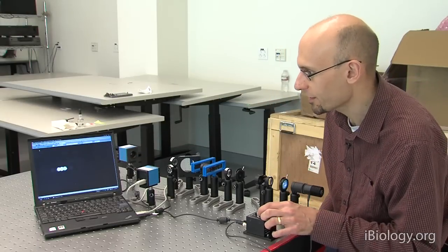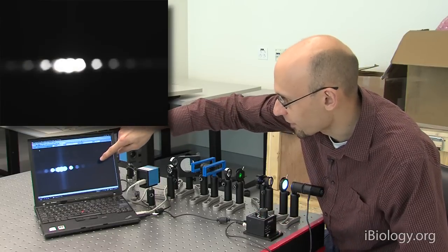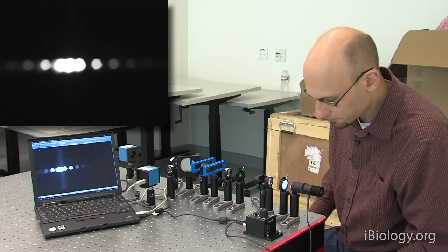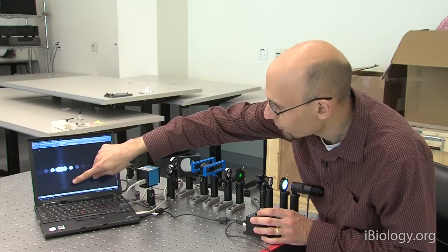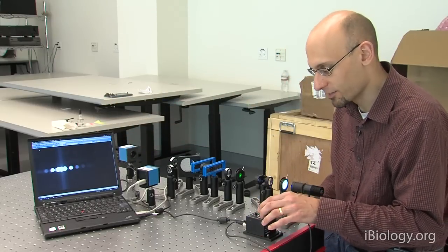If I make the light brighter here, you can see they're not the only diffraction orders, and in fact, there are a whole bunch of diffraction orders that extend out to much larger angles. And the white vertical stripe you may see here is actually an artifact of the camera, so you can safely ignore.